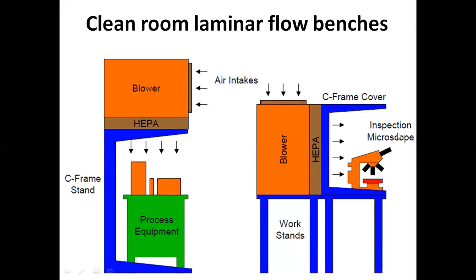Because when you are doing inspection, you would be breathing, and if you breathe on your wafer, it could ruin your device. If you remove the mask and you are breathing, and the vapor or particles of saliva fall on your wafer, it could ruin your product. So you have to do the inspection here.